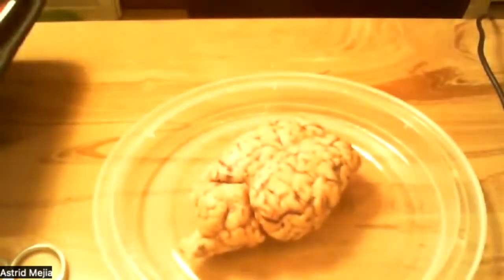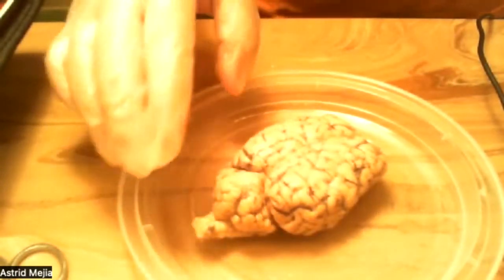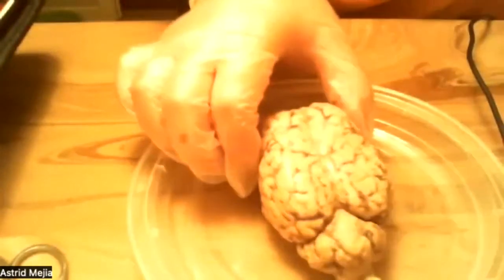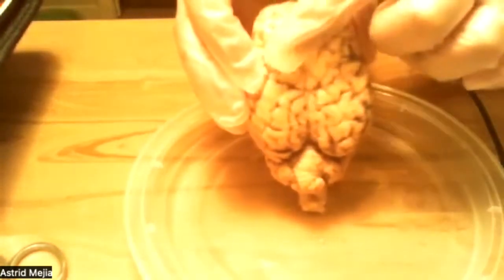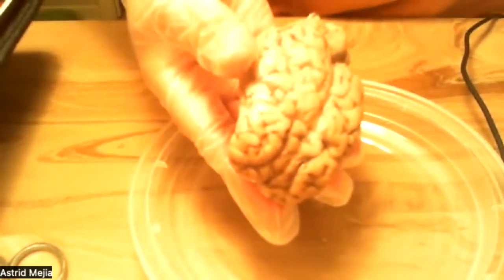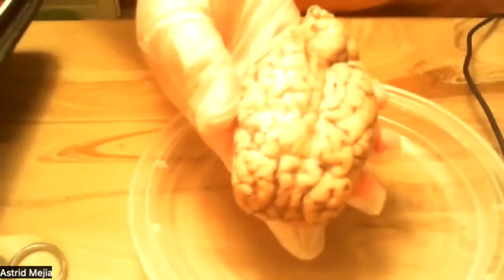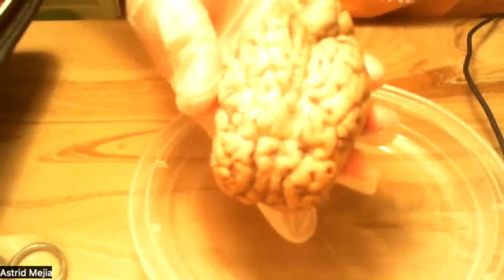Okay, so I'll leave with the light. Okay, so for the dorsal view, it would be like this. The structures I wanted to show are the cerebrum, that basically is a large part of the brain and areas within its control. Within this area, it controls the muscle functions and also it controls speech, emotions, as well as learning.